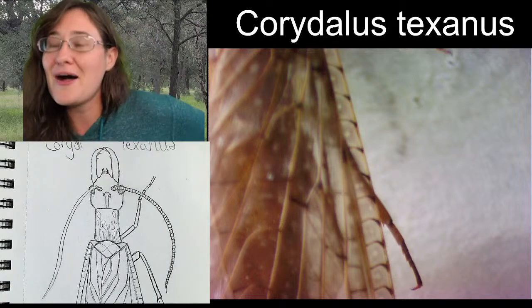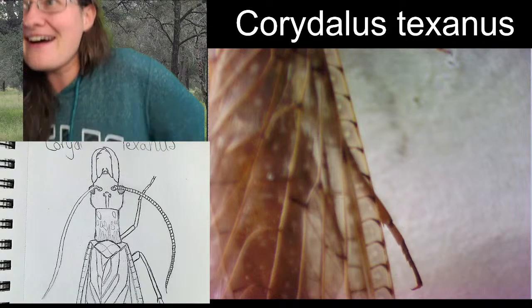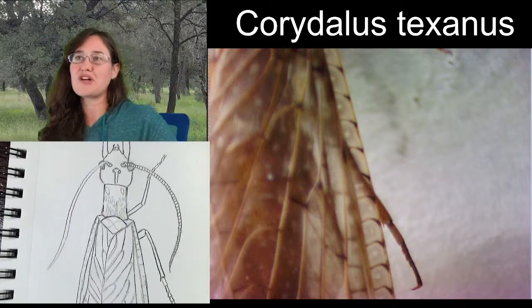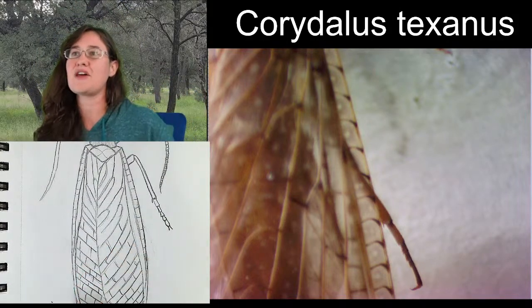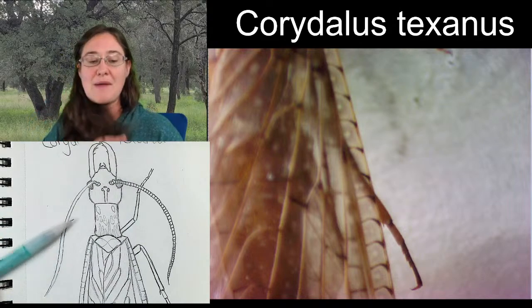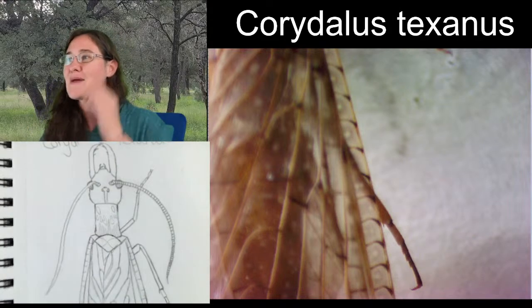I've decided I'm not drawing the hind leg, by the way. I think that it will look odd, plus the hind leg is hidden underneath the wings. So, I'm happy with my sketch. I'm probably going to add these left legs, but I'm going to chat with you guys for a minute.